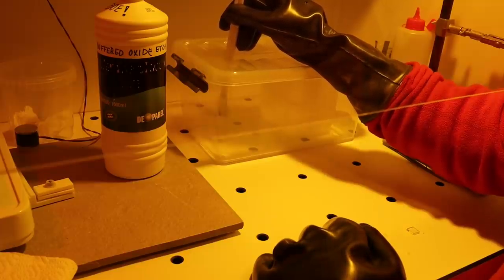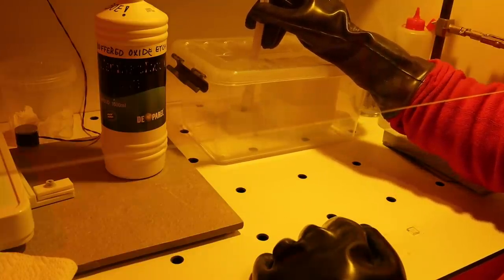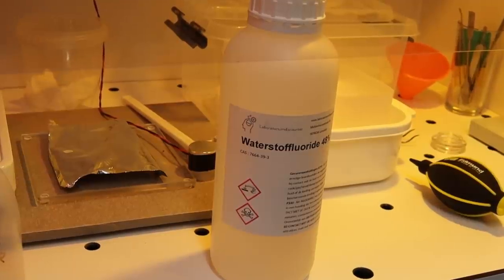But of course, in order to do that, you need to know where the risks are exactly. So that is why I want to spend the first few minutes of this video discussing the risks of working with hydrofluoric acid.